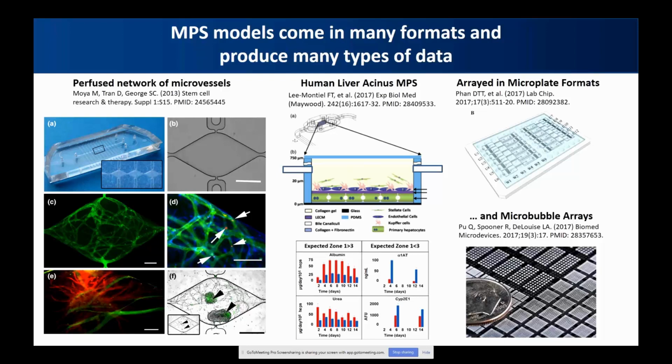Then we take all of those data sets, which come from each of the models, and we want to use those data in some way to evaluate the performance of the model with respect to what's known about clinical effects of drugs on the liver.